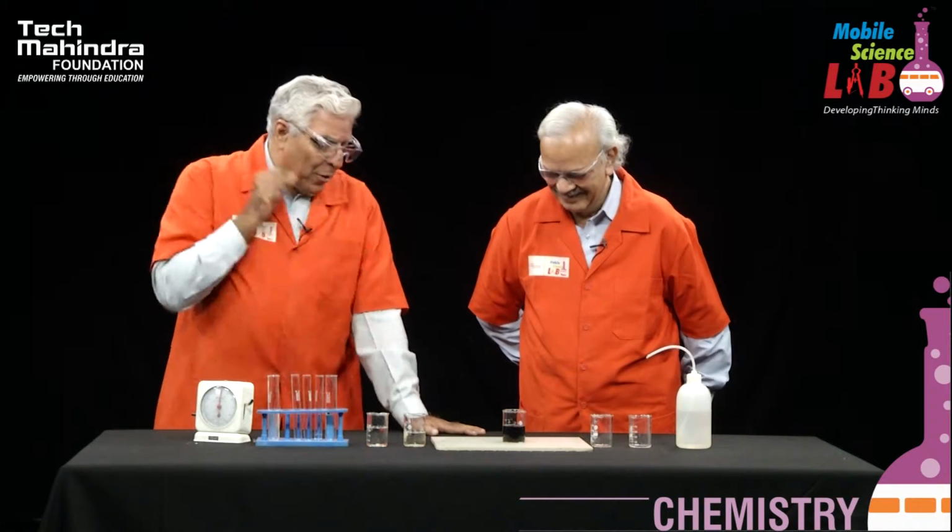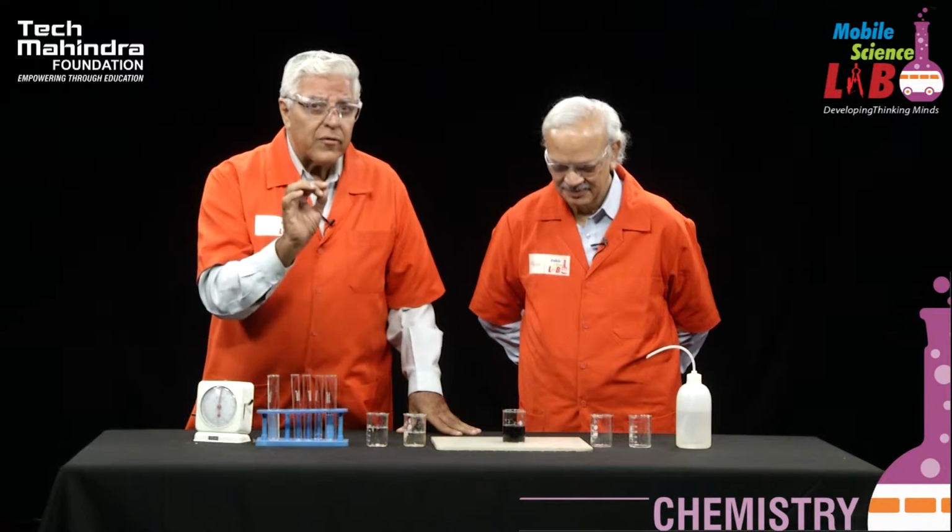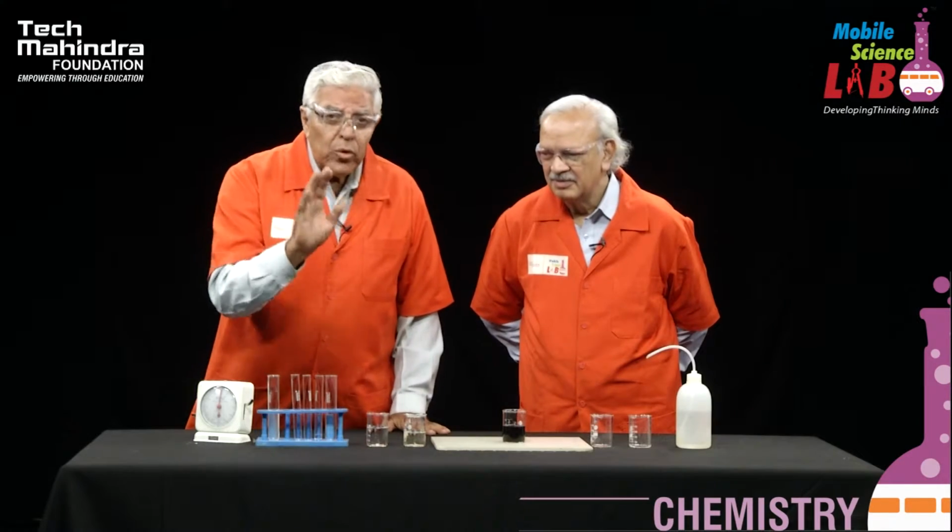To an outsider, to a person who doesn't know science, it will look like magic. Now I can say I'm putting my power into this and I'm getting the color. In fact, if you measure the concentrations very accurately, you can actually predict when the color will change.